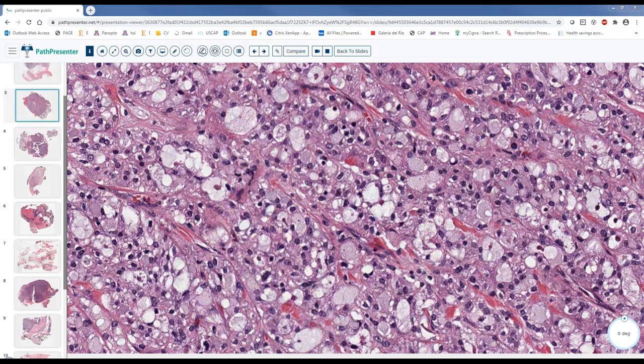I want somebody more specific in this. I agree with Chris. It is acinic cell carcinoma. I agree with you. Can you give me two or three more words of that diagnosis? It is not mask yet. So they will call it acinic cell carcinoma, but they will add zymogen-poor. Okay, zymogen-poor acinic cell carcinoma. Excellent. That's the diagnosis. I don't blame them because they look like secretion, and that's what the diagnosis was there.